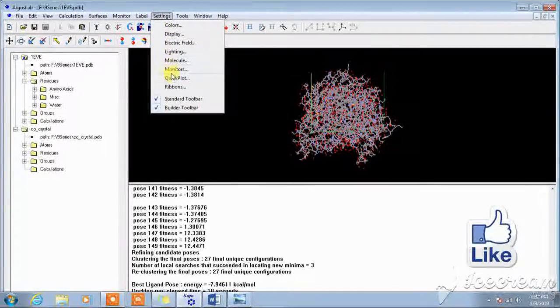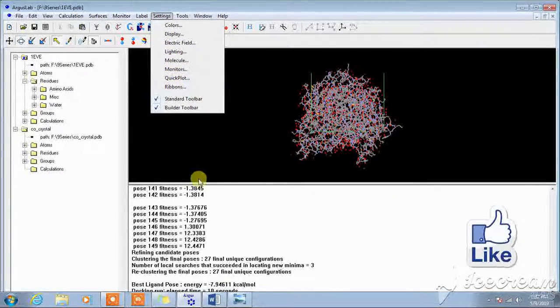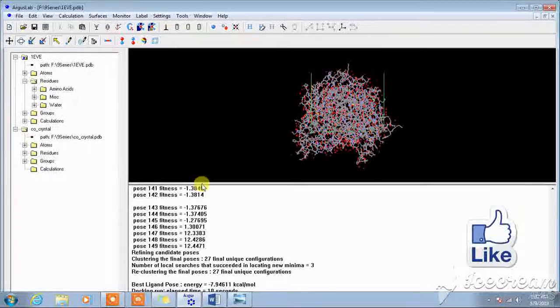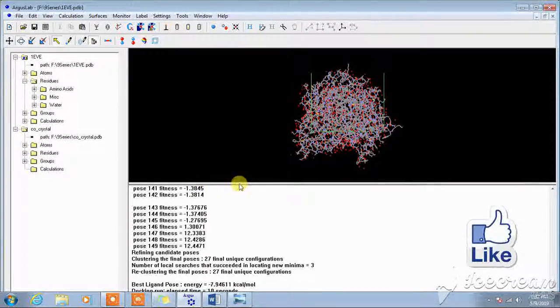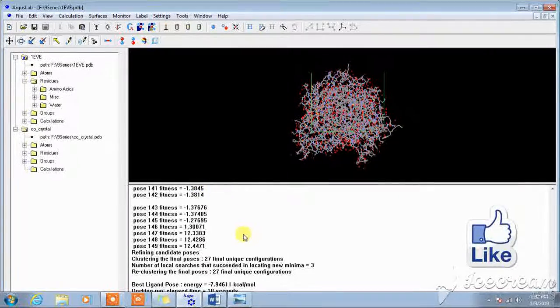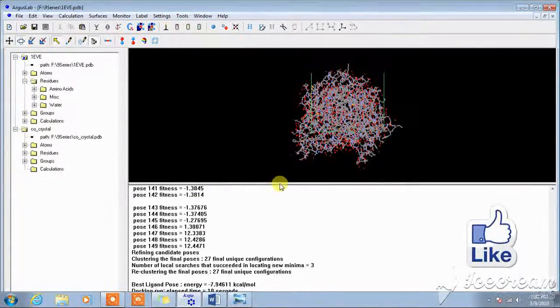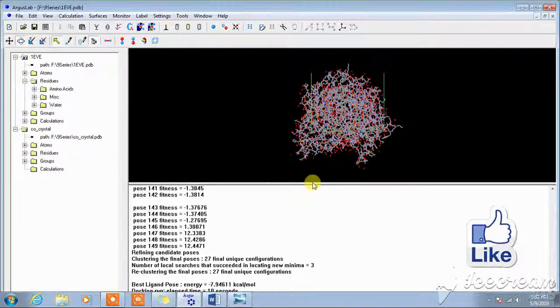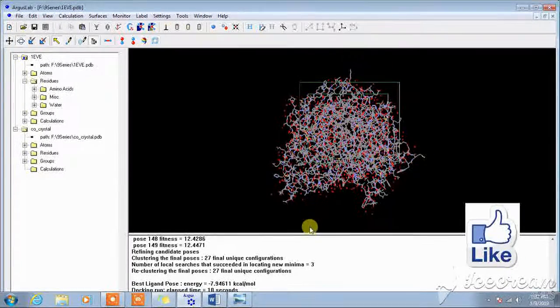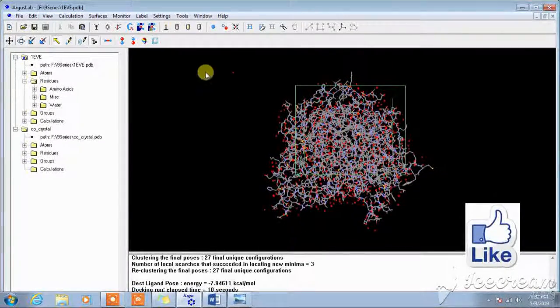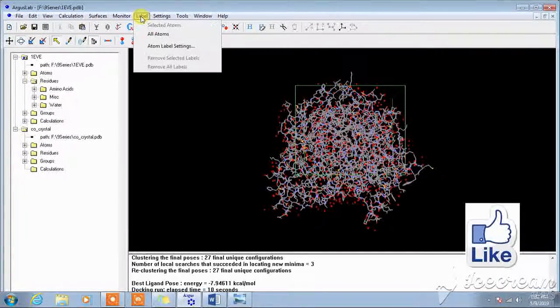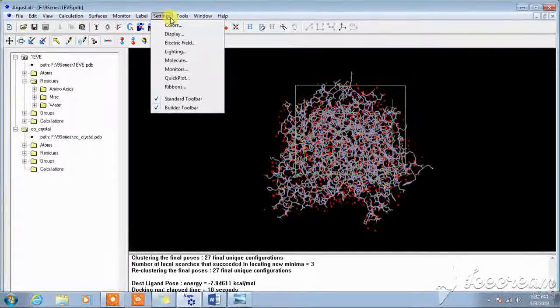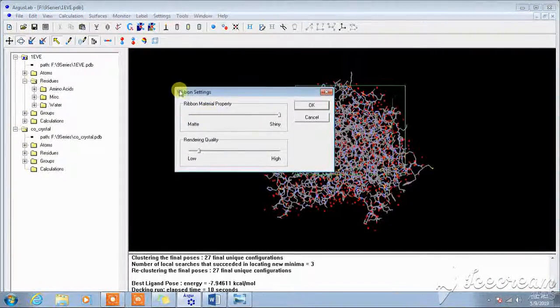Now I would like to tell you how you can take the picture of poses. Minimize this. Setting ribbons, setting ribbons.